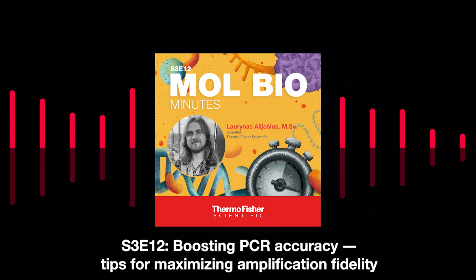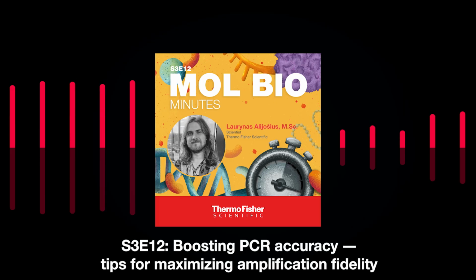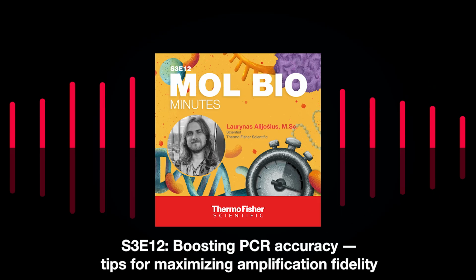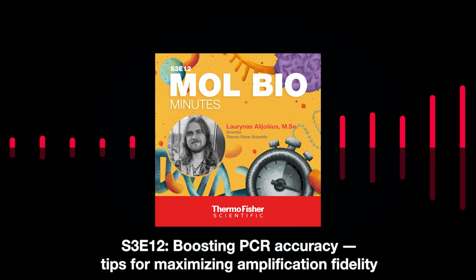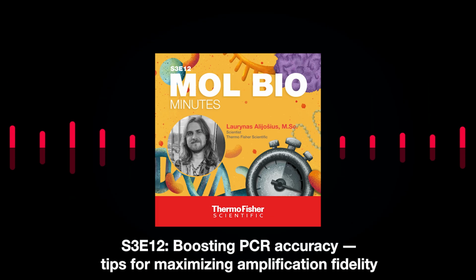or let's say if your DNA template is modified or degraded. For example, if you use DNA from the FFPE samples, that stands for formalin-fixed paraffin-embedded samples, DNA originating from the FFPE tends to be degraded in a way, so that can cause some problems. Also, the overall composition of your PCR reaction mix can impact the accuracy of the PCR.